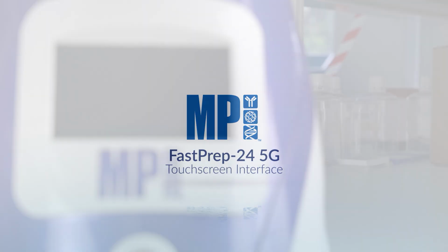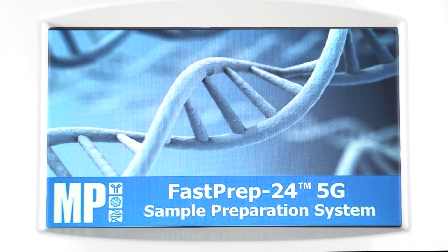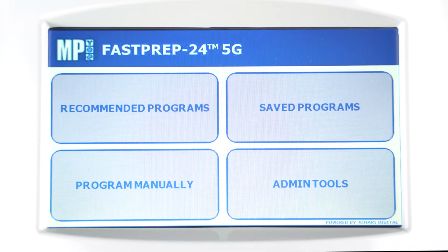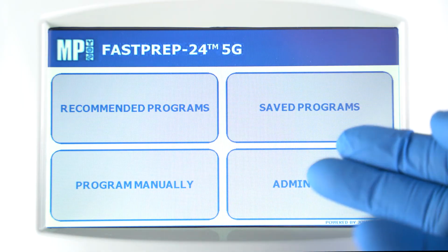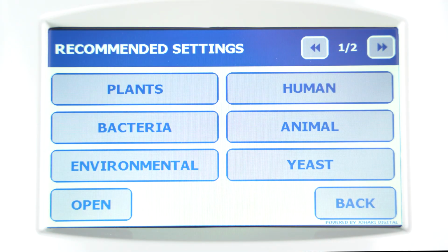One of the biggest advantages of the FastPrep-24 5G is its easy-to-use touchscreen, giving you a true walk-away experience. When the instrument starts, the home screen shows four main options: recommended programs, saved programs, program manually, and admin tools. Tap Recommended Programs to see 72 pre-programmed protocols grouped by sample type.